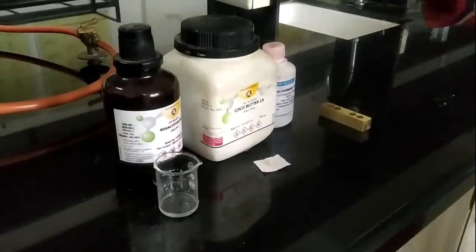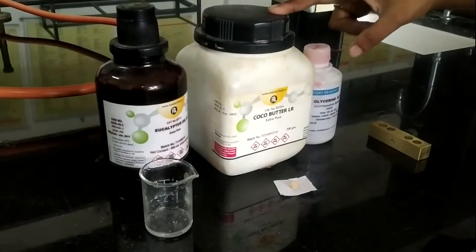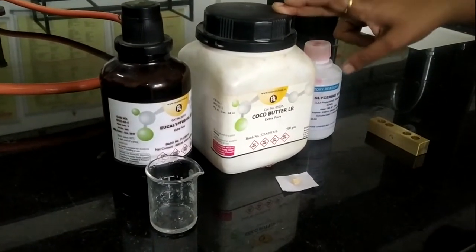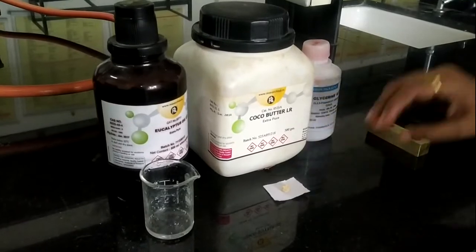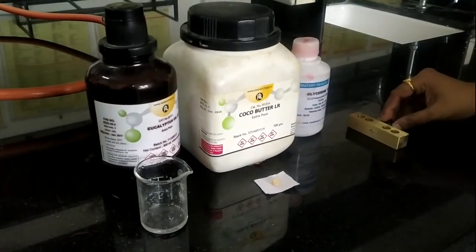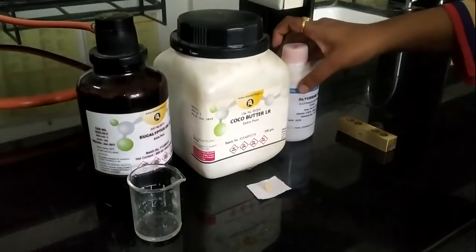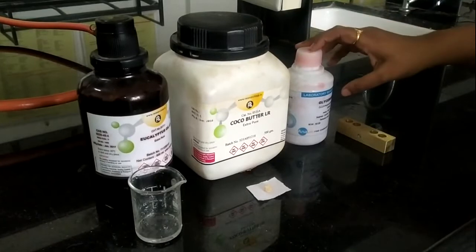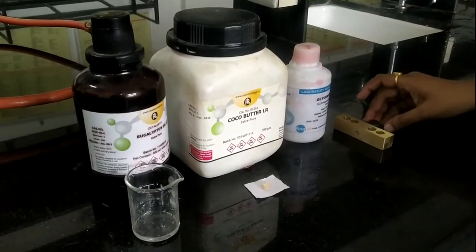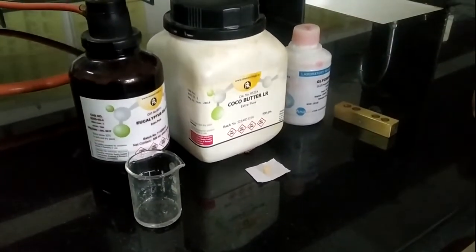So we have eucalyptus oil and theobroma oil. Instead of theobroma oil, we are using cocoa butter, as after melting this cocoa butter, the theobroma oil is formed. And this is glycerin, which is used for lubricating the suppository mold for forming our pessary. Instead of glycerin, one can also use soft soap or 95% alcohol for lubricating the mold. We are going to use glycerin here.